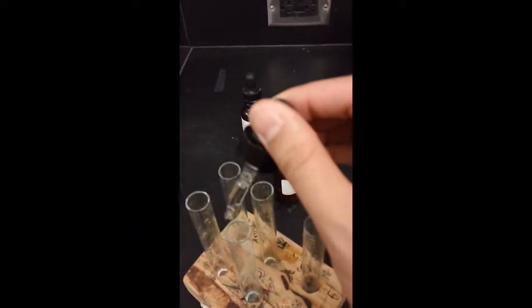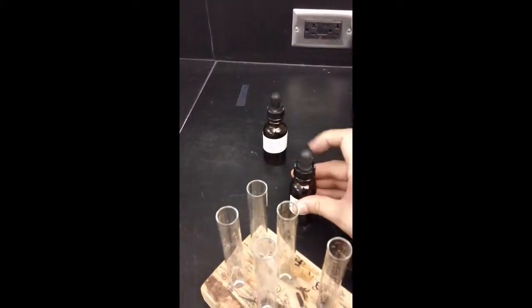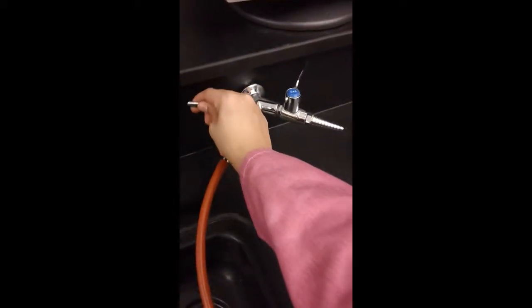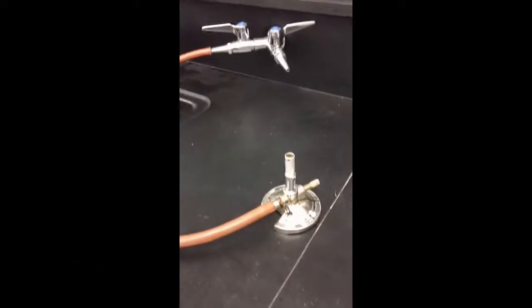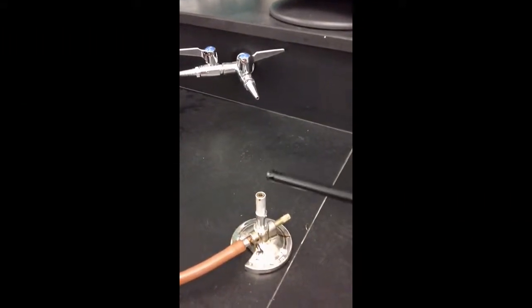So again, 1, 2, 1, 2, 1, 2. What that does is it allows the reaction to be a little bit more dramatic for you to see. Okay, now I'm going to need to light my Bunsen burner. So here I need to make sure that my gas is turned on. Can you hear it? Okay, then I'm going to take my lighter. I'm going to go ahead and light.